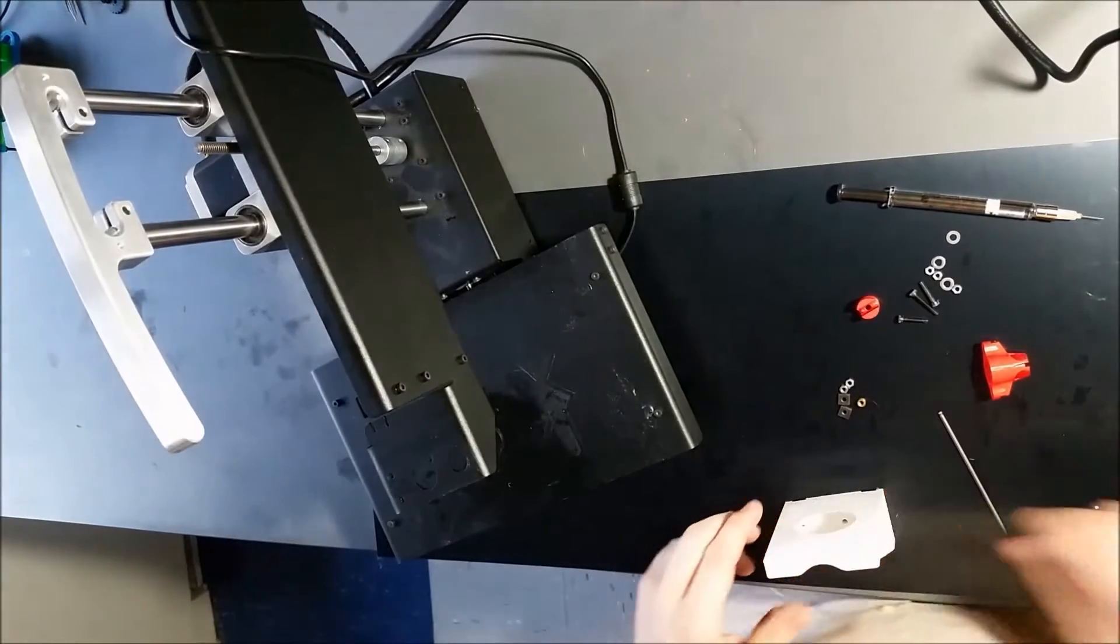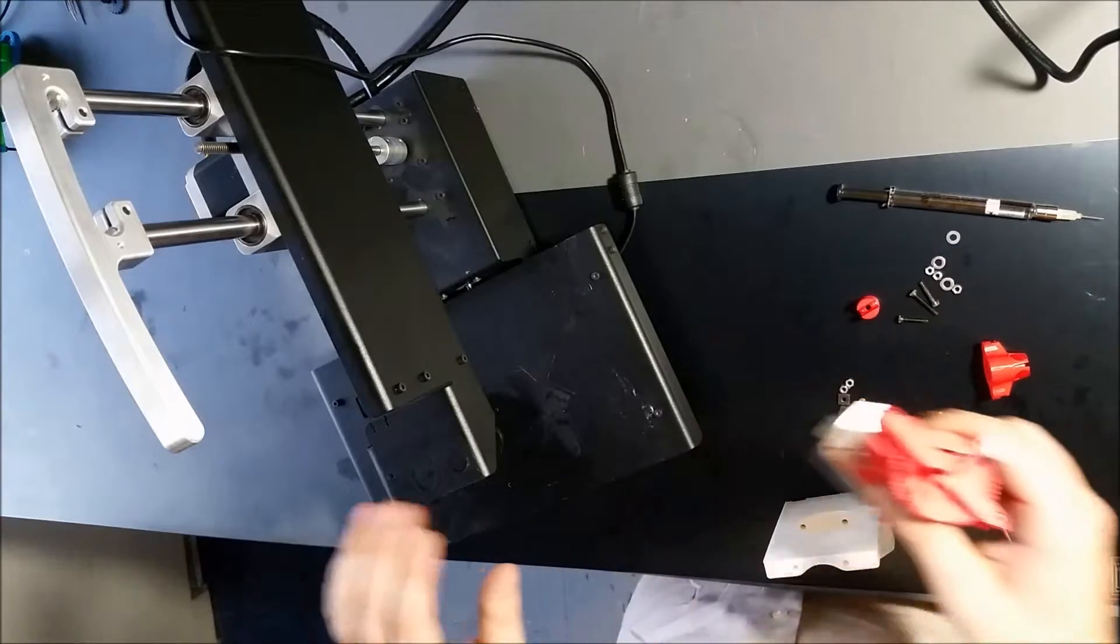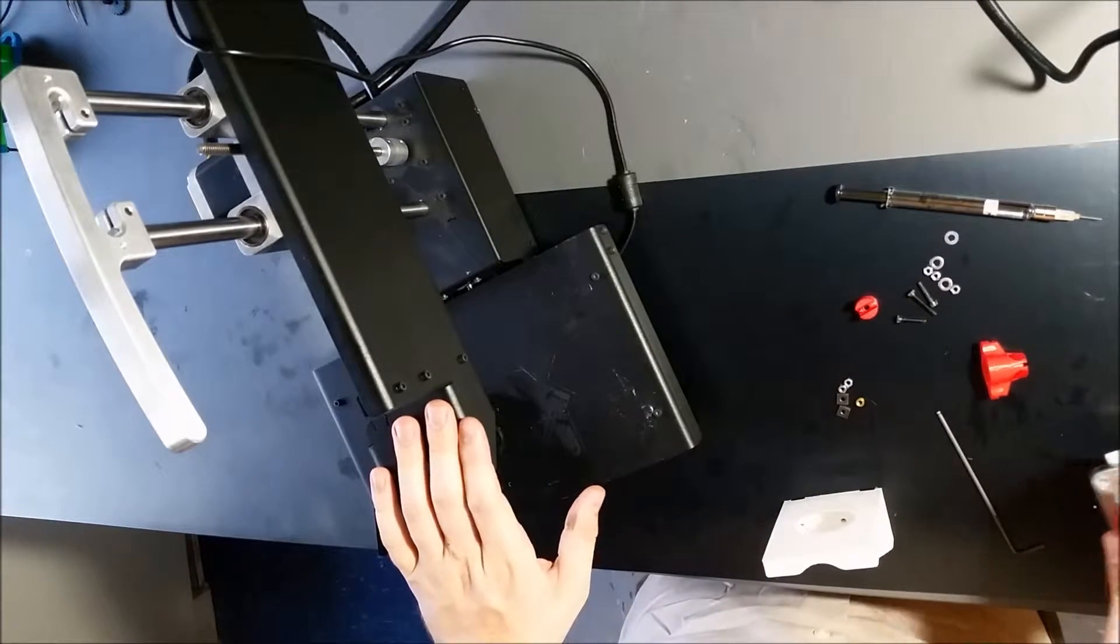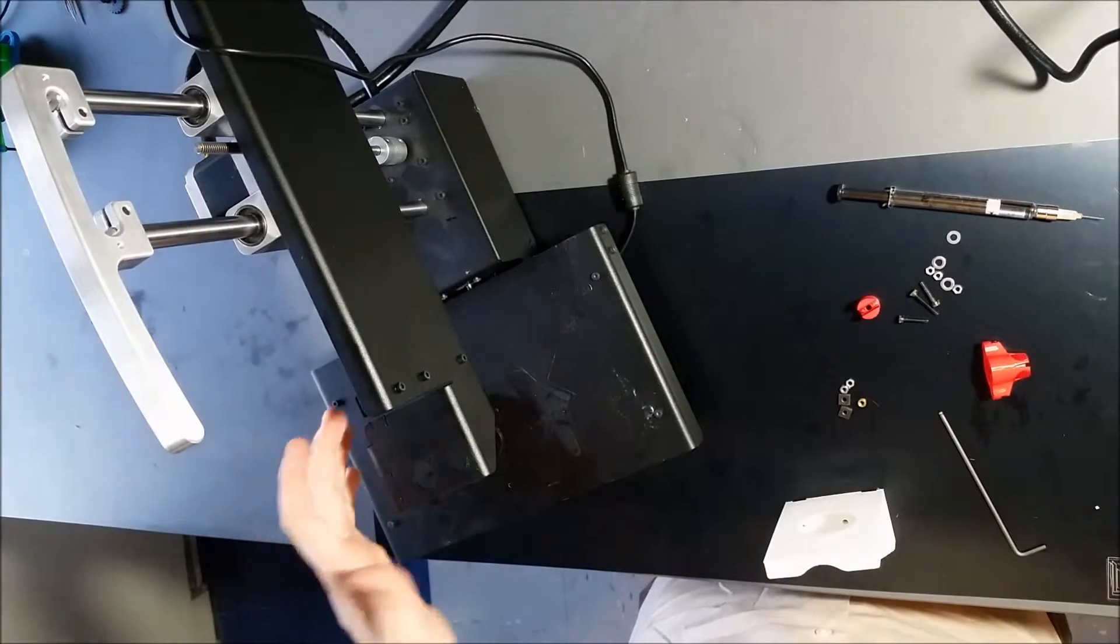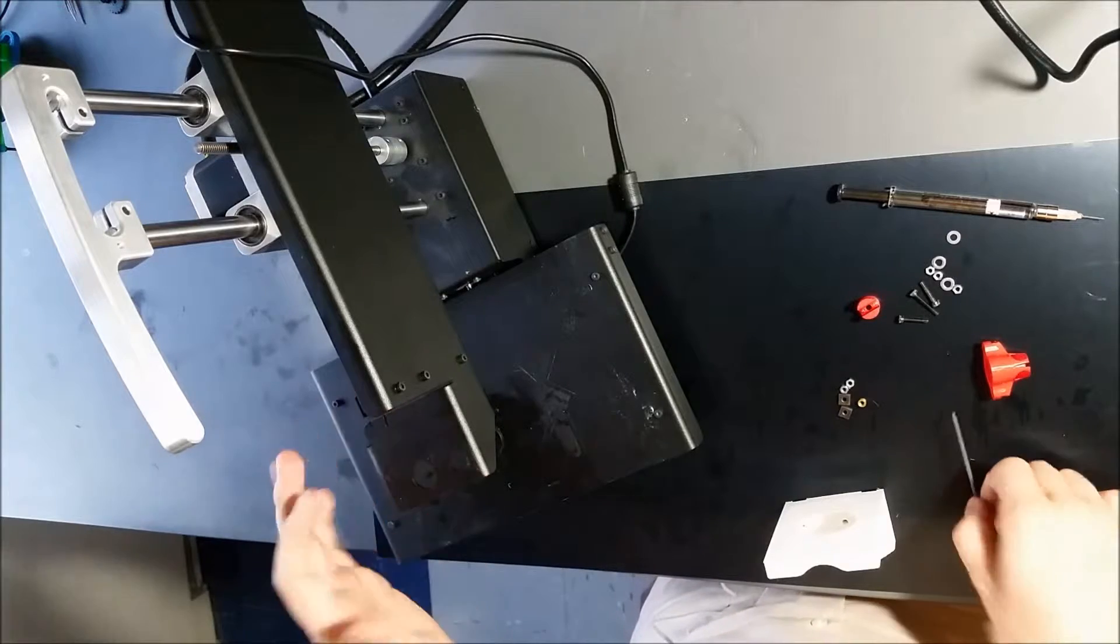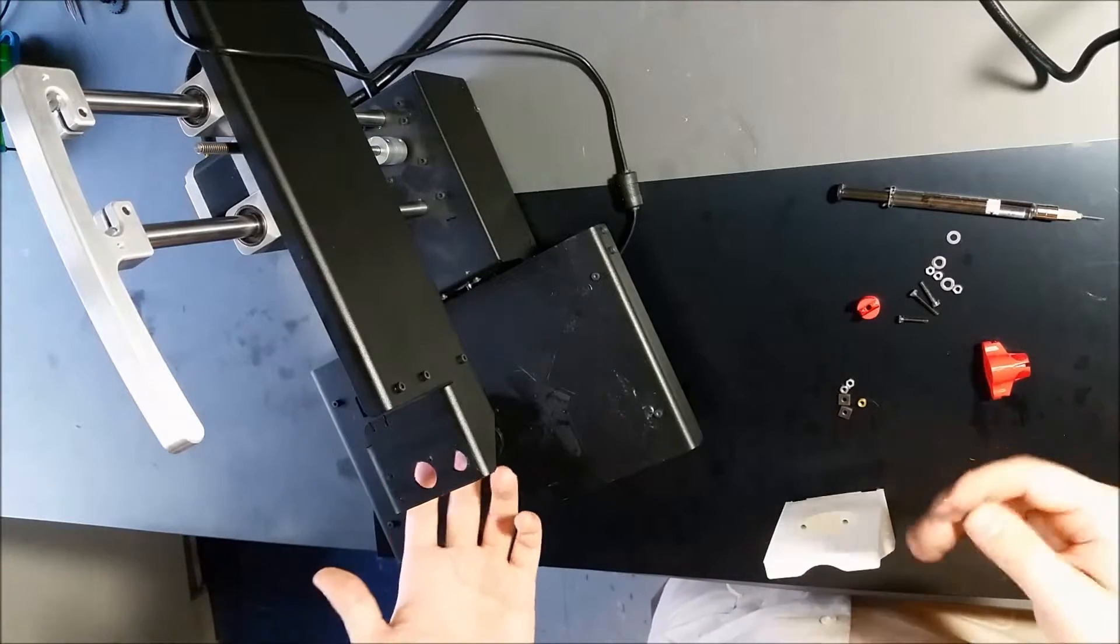We'll put this on the 3D printer. Okay, so now we're going to attach the Replostruder that we put together onto this printer-bought Simple Metal. We've taken the extruder off the Simple Metal. It should be pretty simple for you to do that. No pun intended.